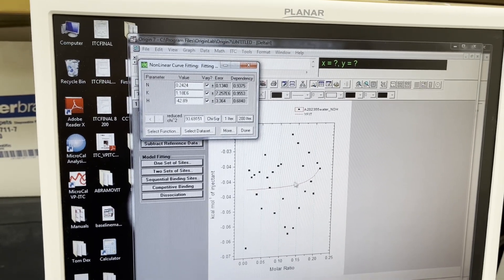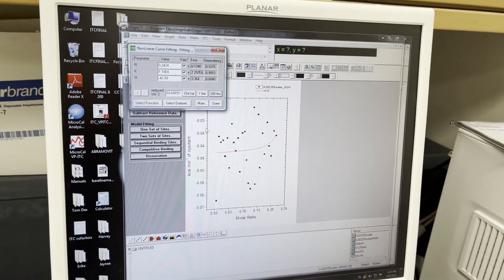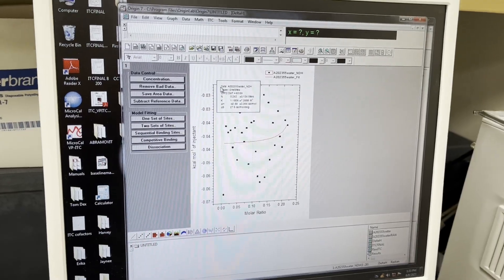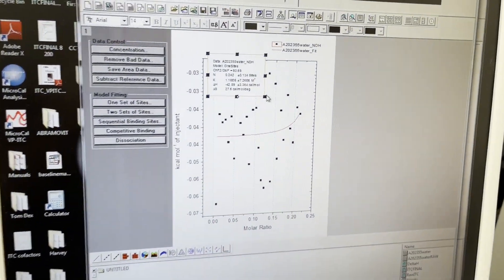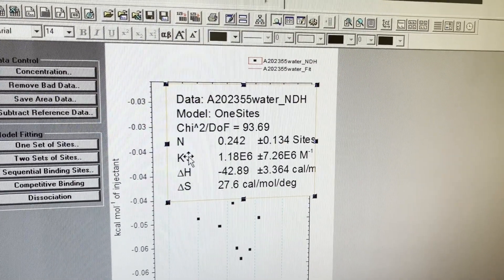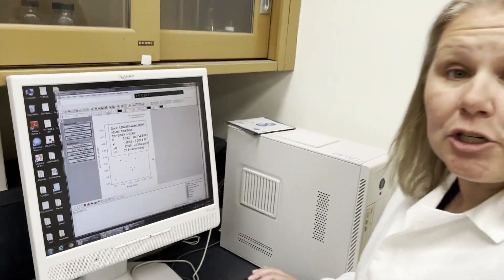This curve fit of course is going to be terrible because there's no real binding there. But pretend you had nice binding. And that's how you get your KD and some thermodynamic parameters. Because once you hit done this will give you your N, your K, your delta H, and your delta S. So that will give you all of that information.